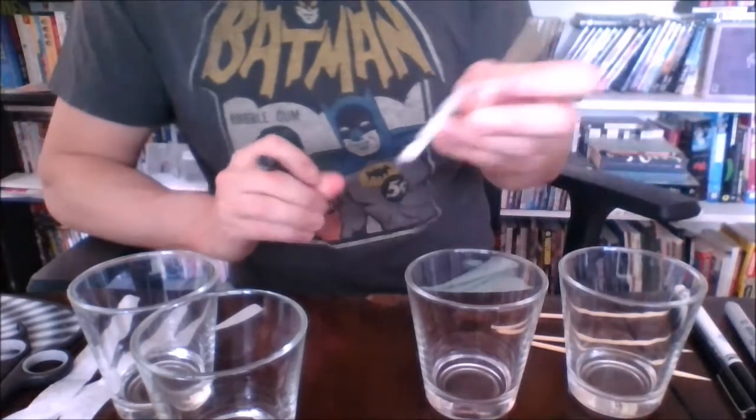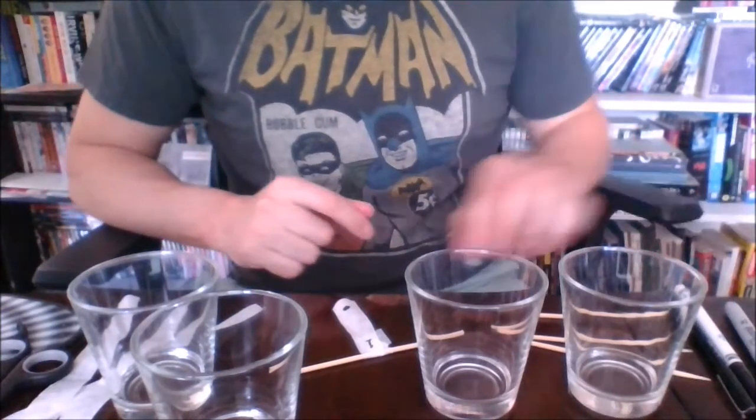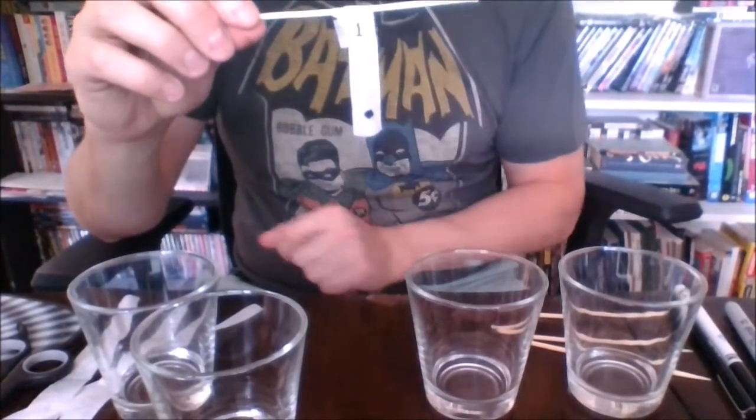So again, not a bad idea to have something down. I did have a little bit of smudge come through that I had to wipe up with my finger just there. So about 1 centimeter up, put a big dot. I'm going to do this for all of my samples, numbering them as I go so I can track which is which. Again, sample 1 is my gel pen.